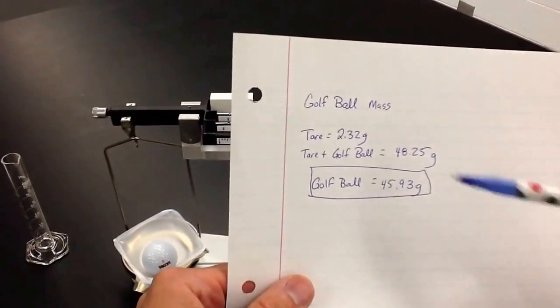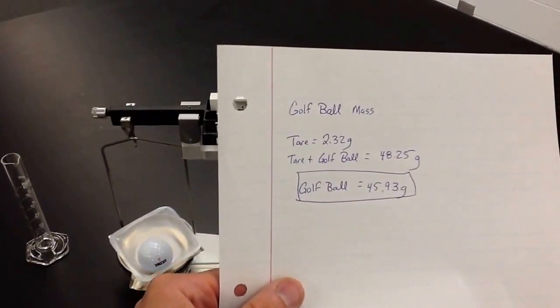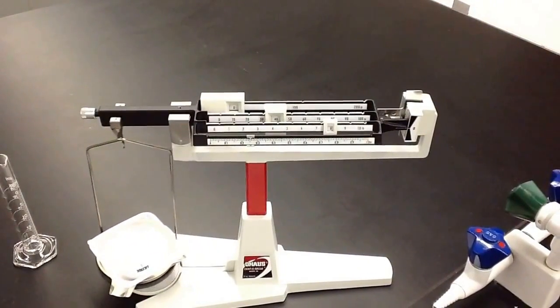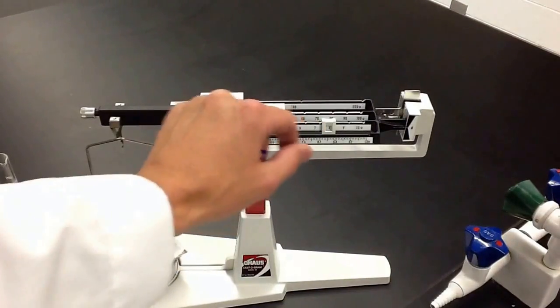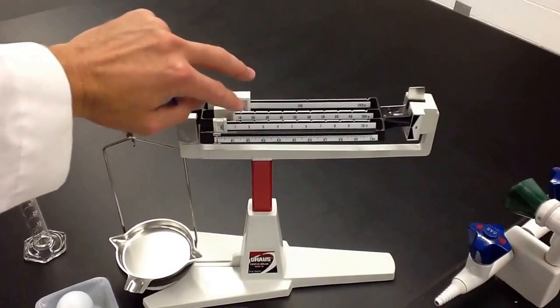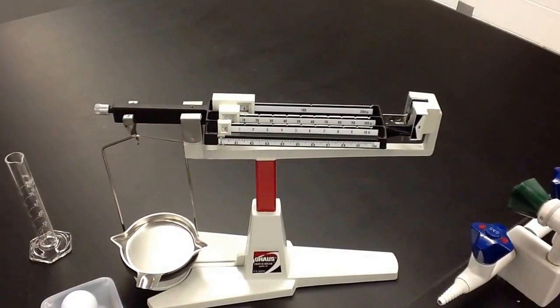That's the work you need to show each time. That's how you use the balance. When you're done, make sure you put everything back to zero — slide these back to zero — so that's all set for the next person.